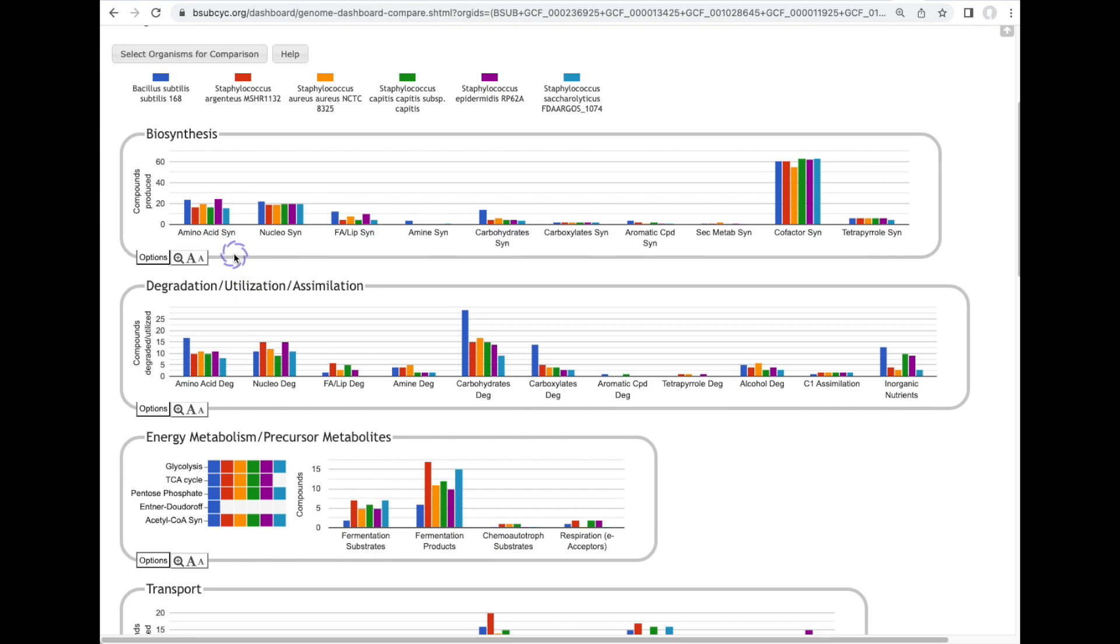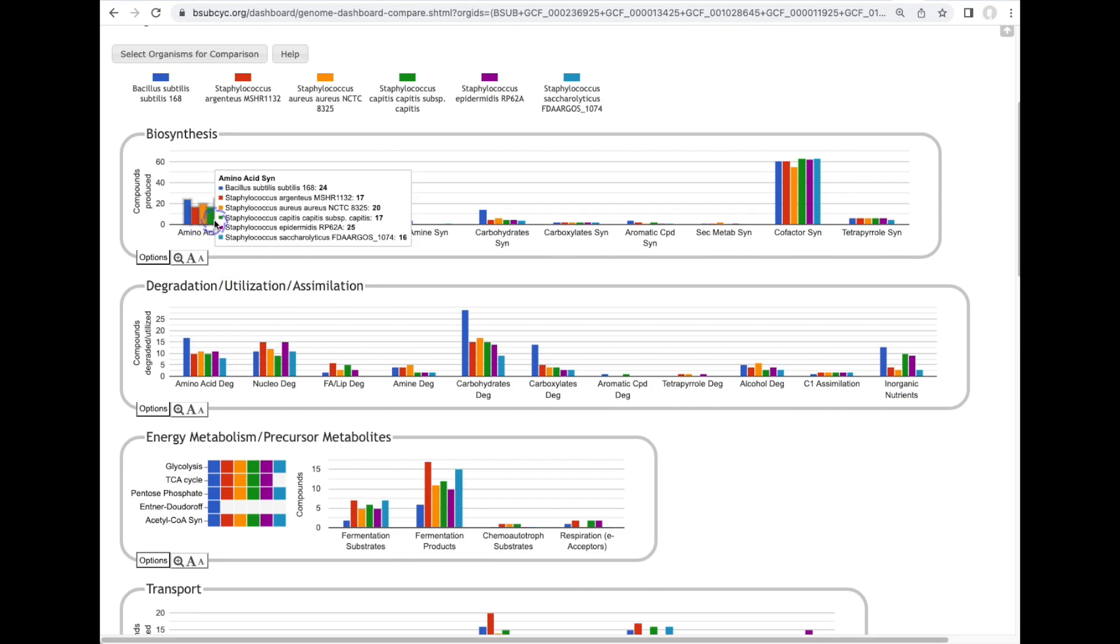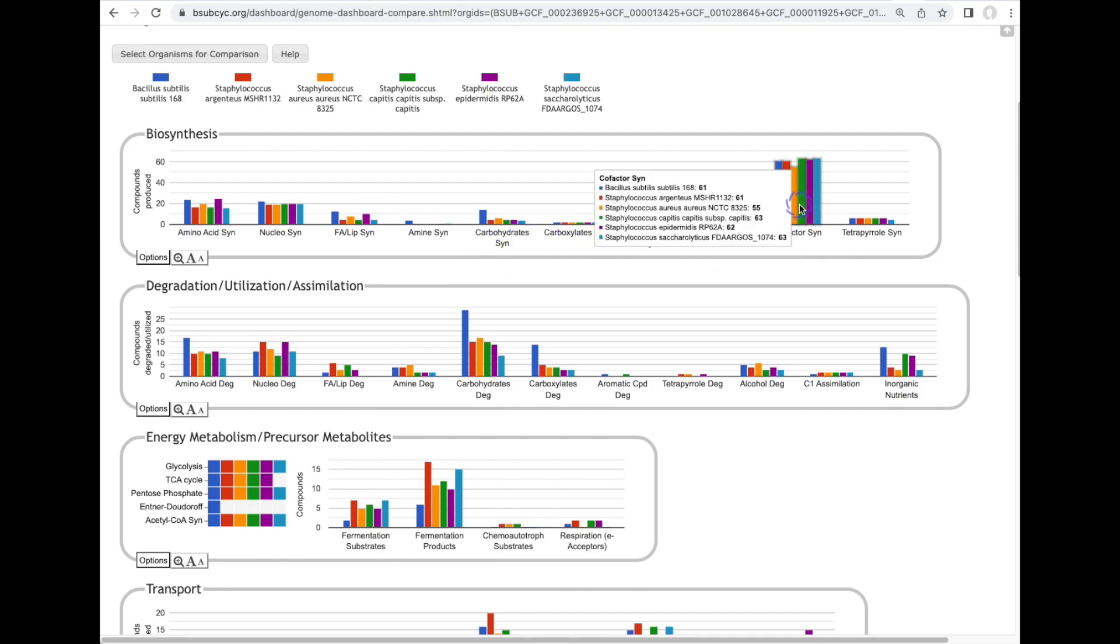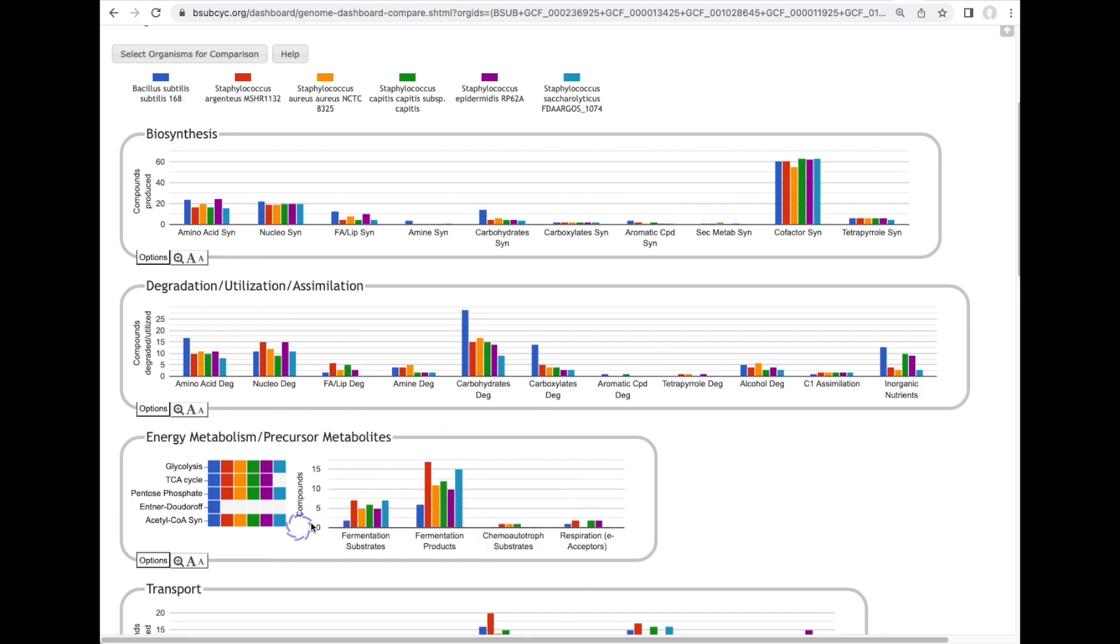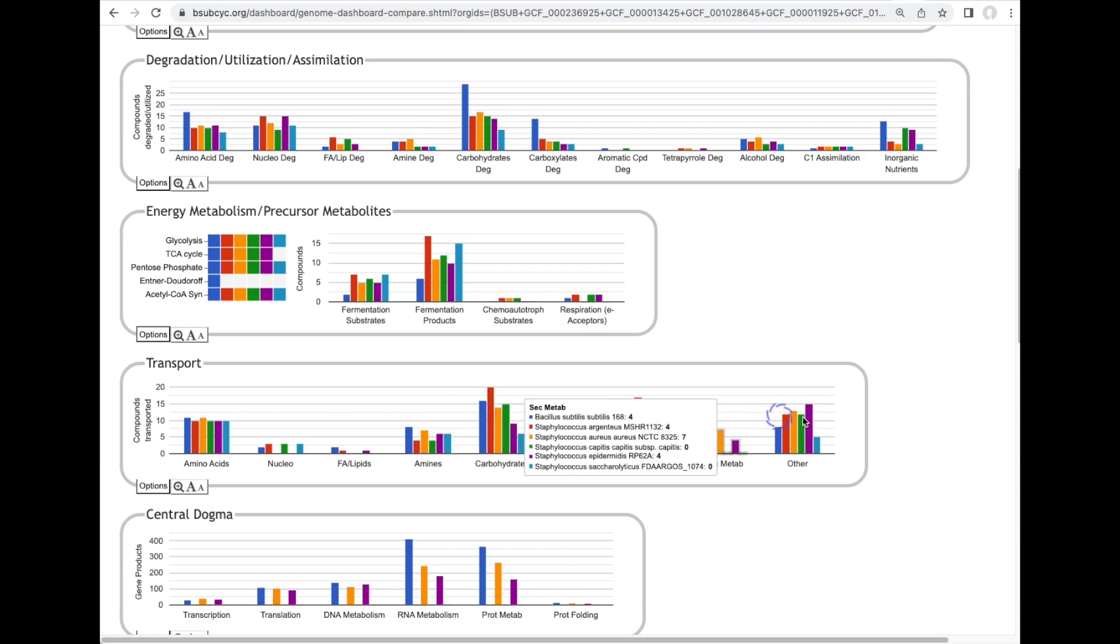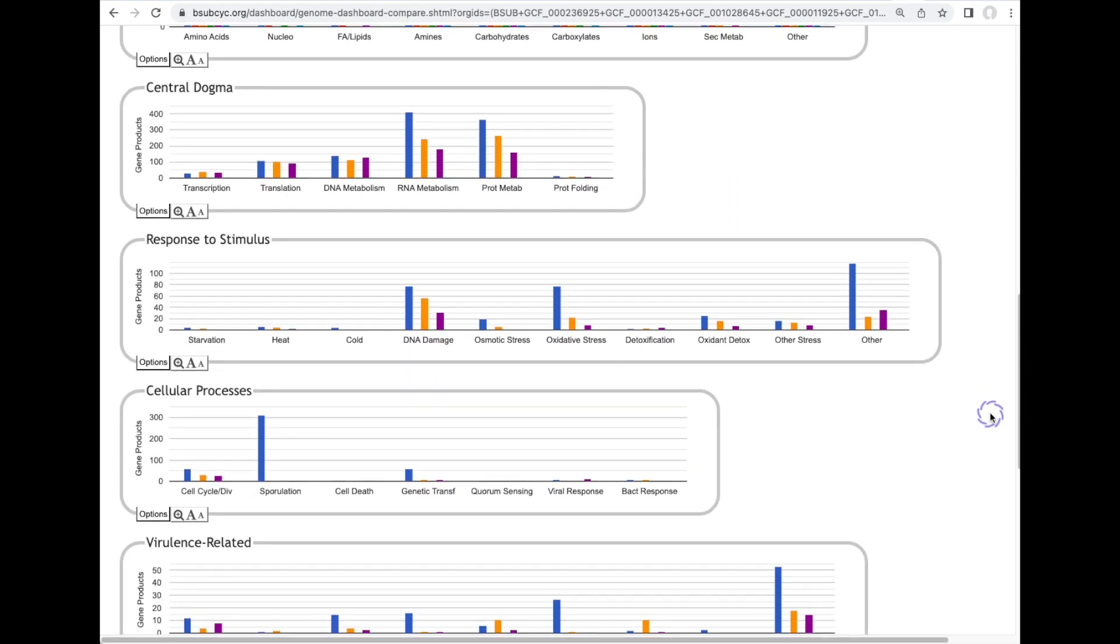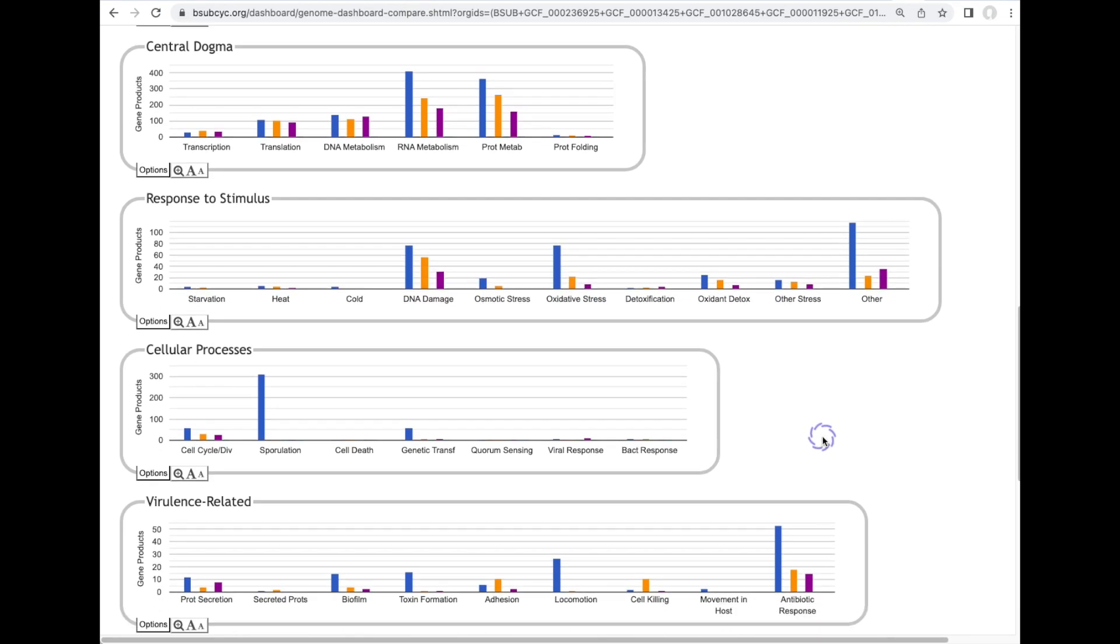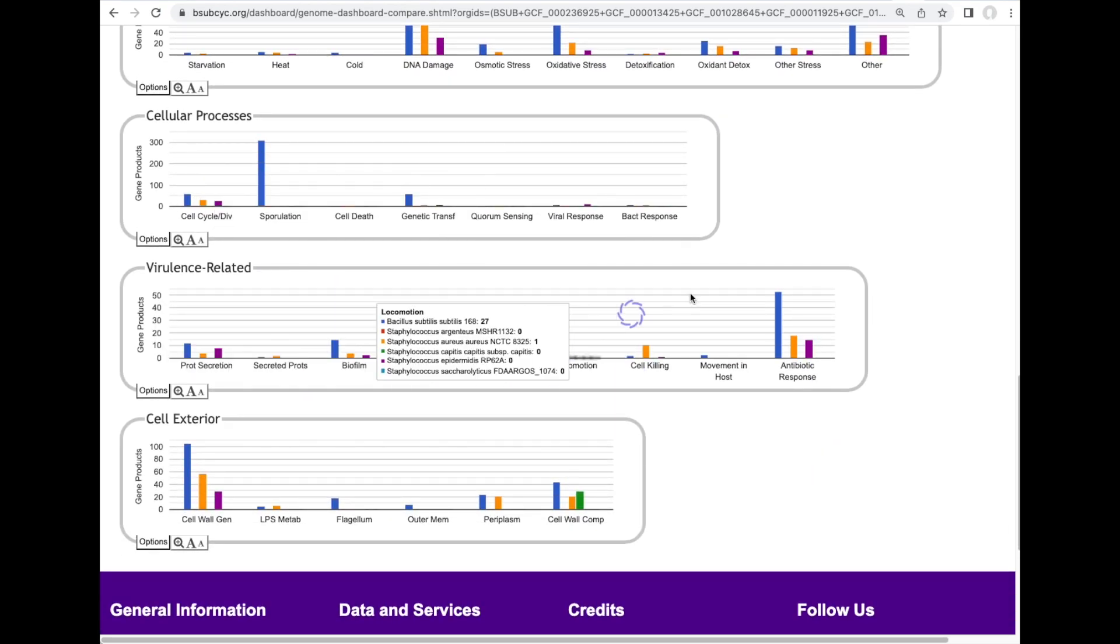For example we're showing listing if we're showing here the number of amino acid biosynthetic pathways present in each of these genomes and the number of carbohydrate biosynthetic pathways, cofactor biosynthetic pathways, carbohydrate degradation pathways, energy metabolism pathways, transport capabilities, central dogma genes, response to stimulus, cellular processes and virulence related genes.